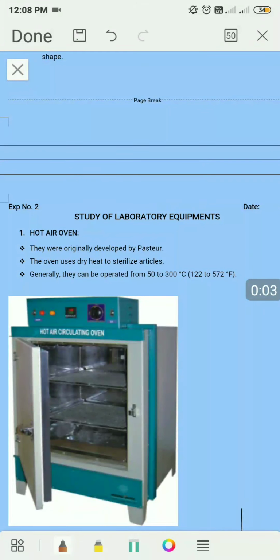Hi friends, in this video we are going to discuss the laboratory equipments that we are going to use in the lab and their uses.